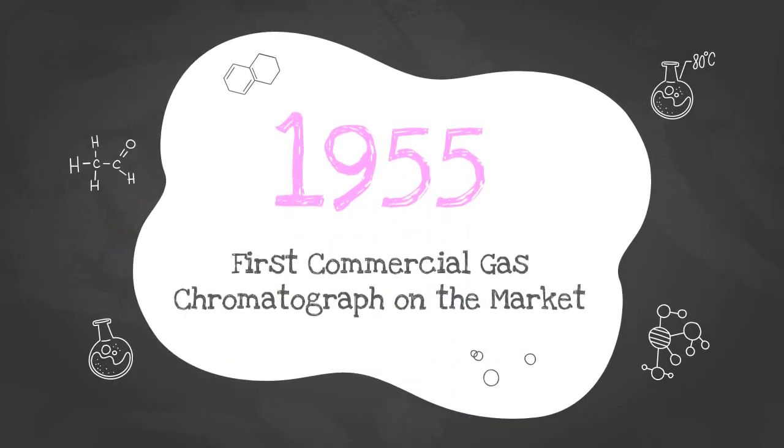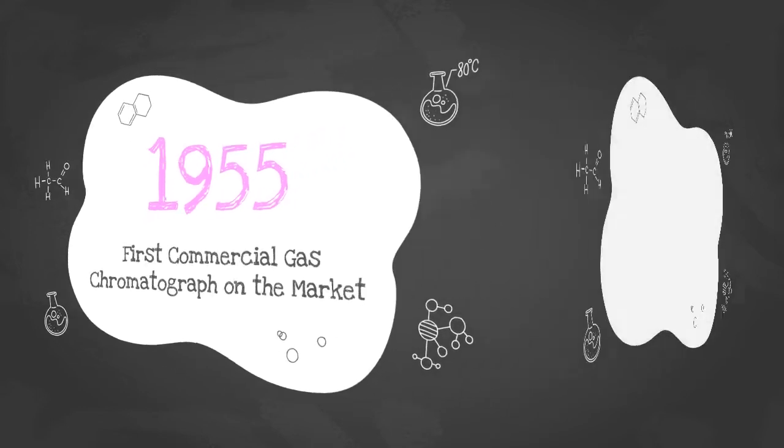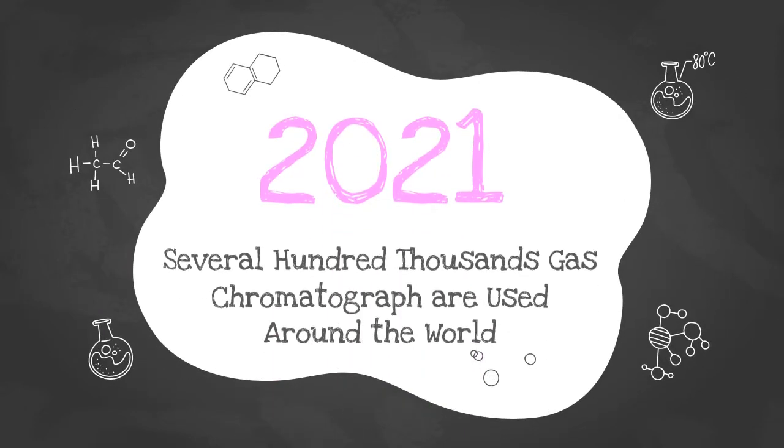In 1955, the first commercial apparatus for gas-liquid chromatography appeared on the market. Since that time, the growth in applications of this technique has been phenomenal. Currently, several 100,000 gas chromatographs are in use throughout the world.